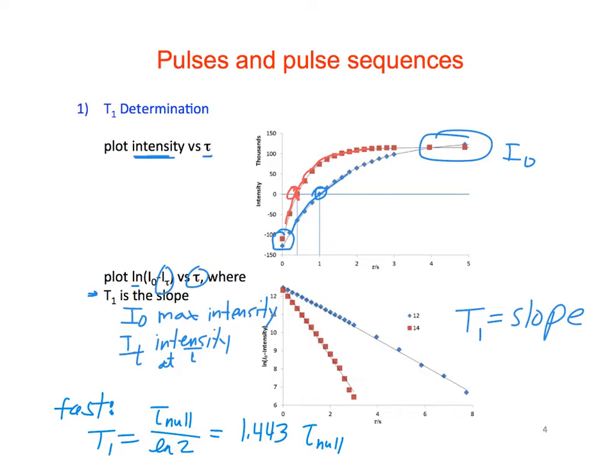And I naught again was, how do we determine that again? What was which? I naught. I naught is the maximum intensity, versus the intensity at any specific time. All right. I'm sure there's an experiment on the spectrometer to do this as well. Yeah, it looks like I'm maxing out my memory here. We have to erase some stuff.